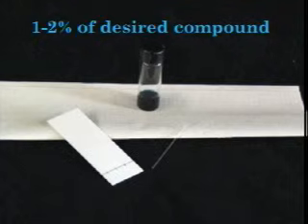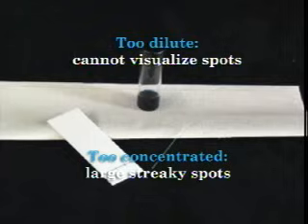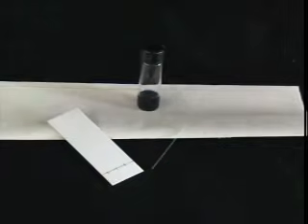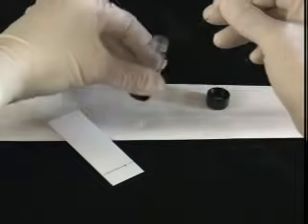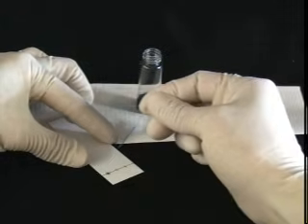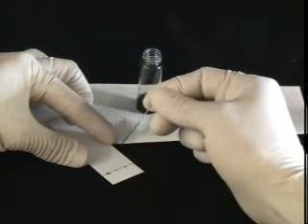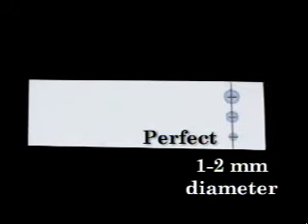Applying your sample to the plate is probably the trickiest part of TLC, and it may take some practice before you can consistently apply the right amount of sample in a small enough spot. Your TLC sample should be fairly dilute, containing approximately 1 to 2 percent of the desired compound. If the sample is too dilute, you will not be able to visualize the spots. If the sample is too concentrated, you will observe large, streaky spots on your final plate. To spot the plate, dip the glass spotter into the sample and touch it lightly and quickly to the plate. Wait briefly for the solvent to dissolve before spotting again. Generally, 1 to 3 spots will suffice. It is crucial that you do not leave the spotter on the plate for too long, or you will end up with large, diffuse spots. Try to keep the spots 1 to 2 millimeters in diameter — the smaller, the better.